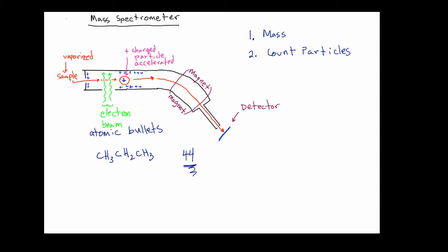In the previous videos, I've described how the instrument works. So I strongly suggest that you make sure to watch these videos in sequence. In any case, coming back to the point, when a highly structured molecule enters this beam of electrons, what's going to happen is that we are going to fragment the molecule.